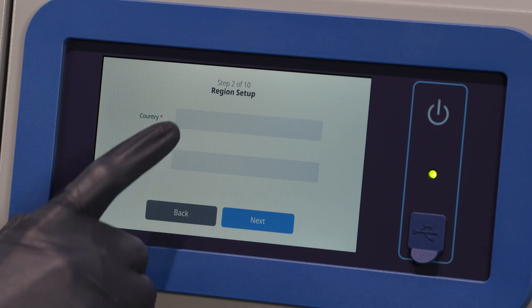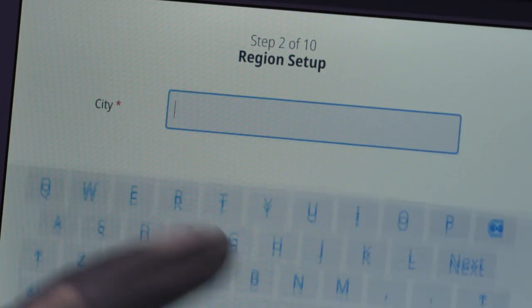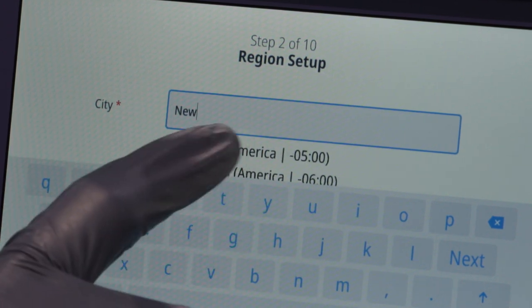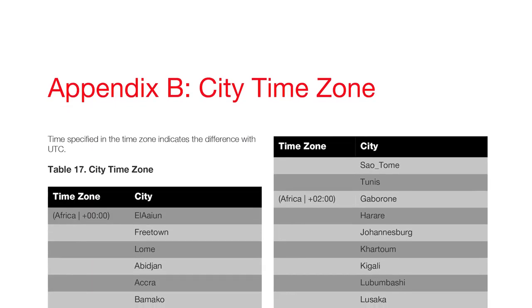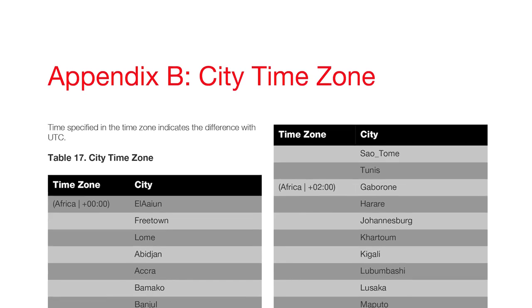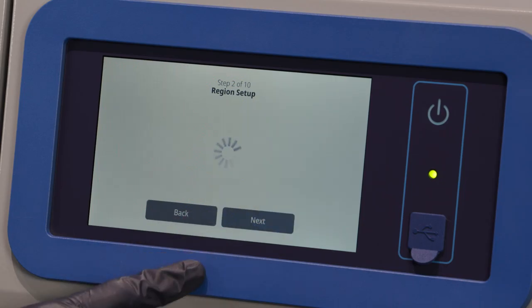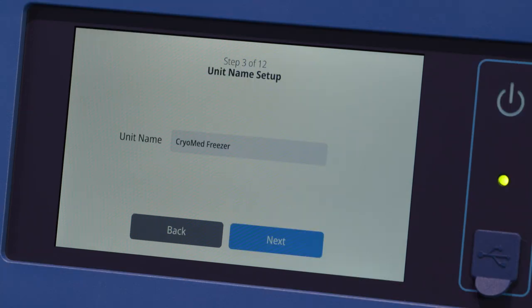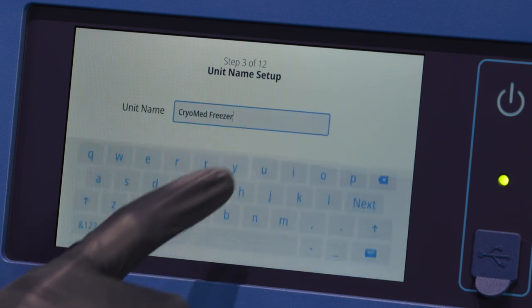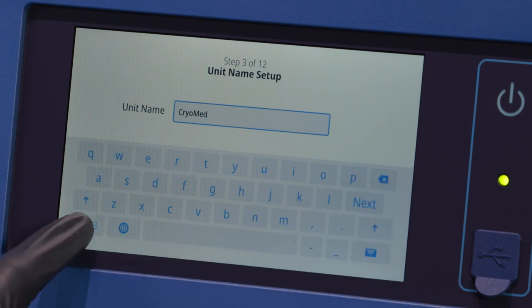The next screen allows you to select your location. Enter the name of the country and the city and select from the list of suggestions displayed. When entering your city into the region setup screen, refer to Appendix B, City Time Zone, and follow the table to select the city closest to your time zone. After selecting the region, press the Next button. In Step 3, you have the option to assign a unit name to the Cryomed. If you have more than one Cryomed in your facility, you may want to consider a unique name for your unit.